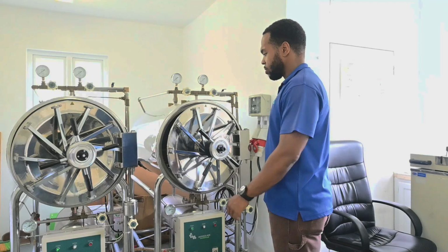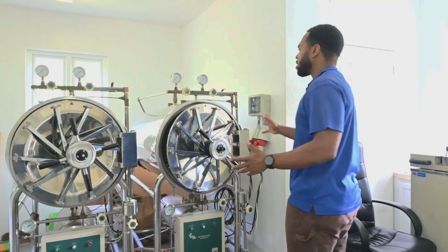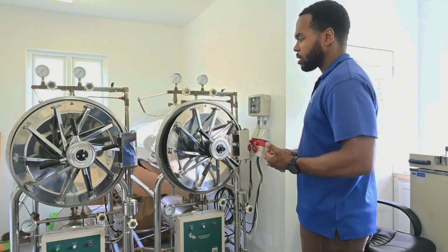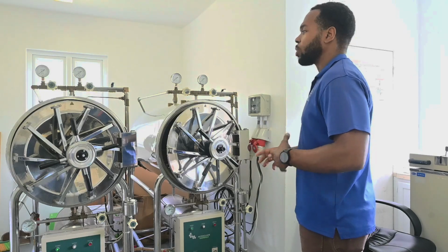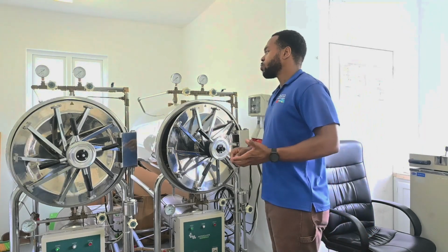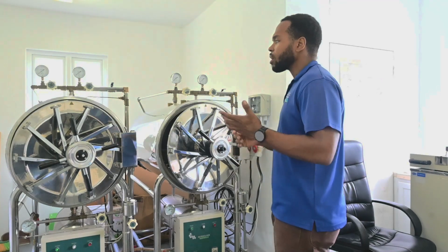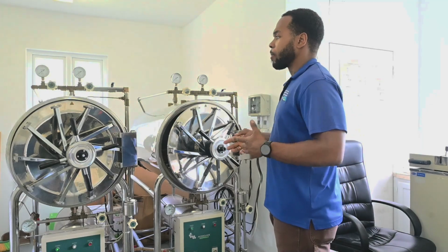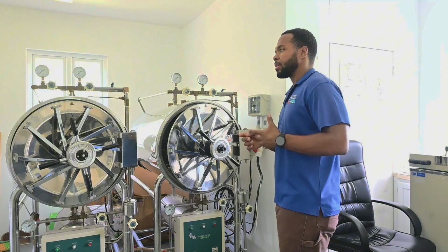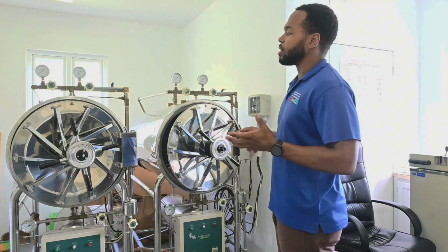The first process we have to do is we have to fill the autoclave with water. These two devices you see are called autoclaves. What they do is they use water to create steam and pressure to heat the contents of whatever is placed inside of it. The purpose we use it for is, after we create the medium, it has to be heated. The heating process is to dissolve what is called the agar in the media. The agar is the gelling agent that allows the medium to solidify.